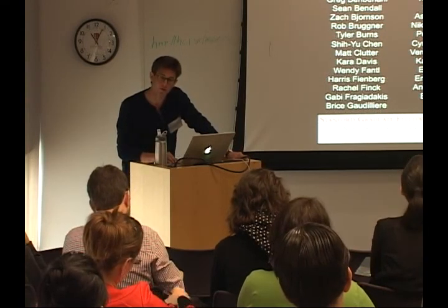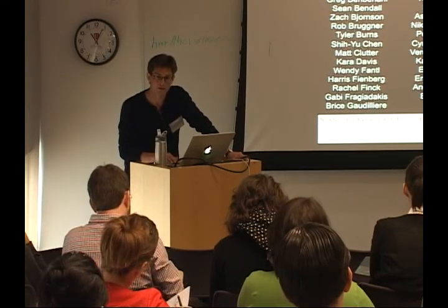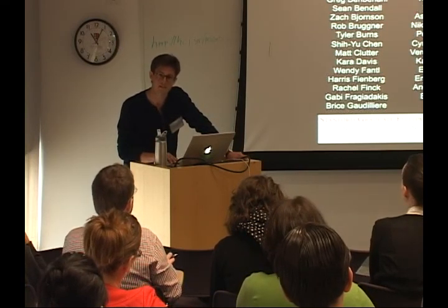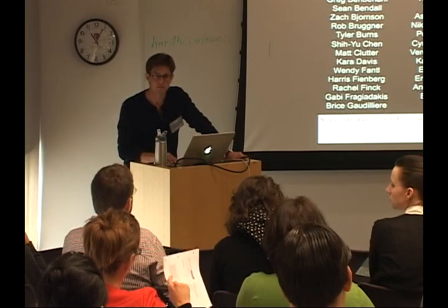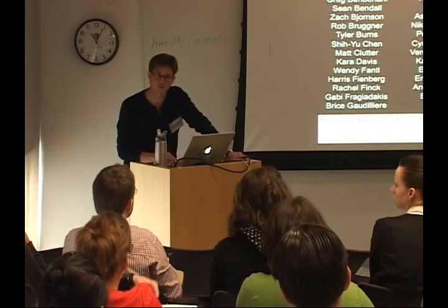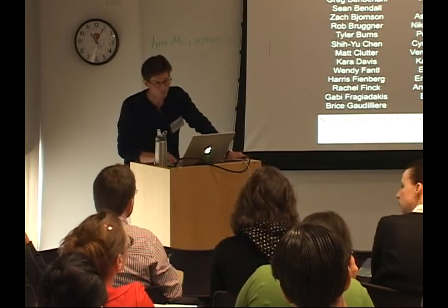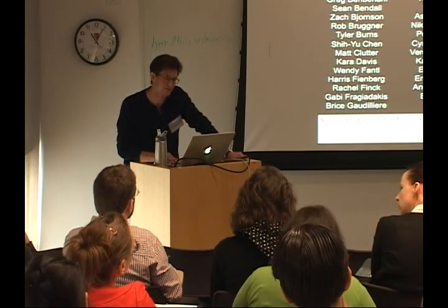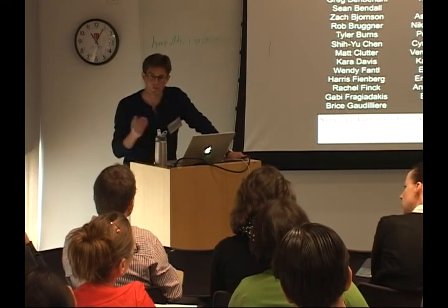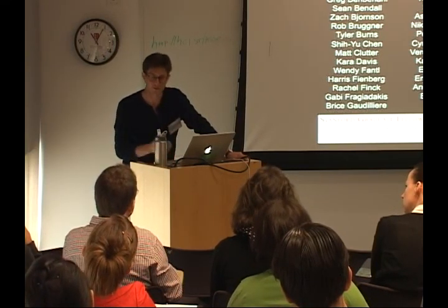We're really hoping that the nanoparticle-based reagents will help us in that regard. But yeah, CD25 on mouse works pretty well. On human, it works, I'd say, decently well. But there are a number of things that we would like to be able to measure with greater dynamic range than we're able to right now. But that's generally the case on fluorescence-based flow, too. If you have to design your entire panel to have CD25 on PE, it's still a pain in the butt.